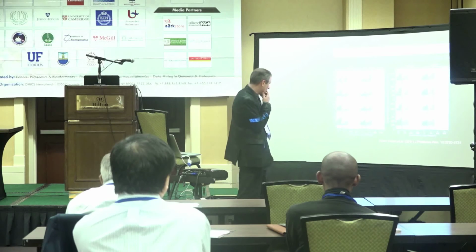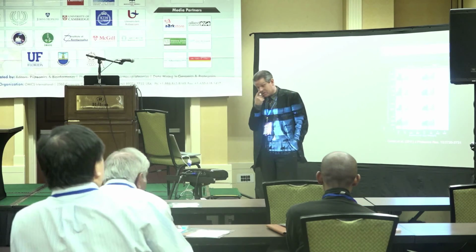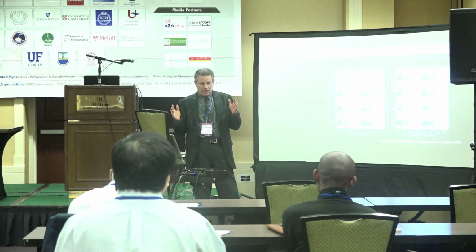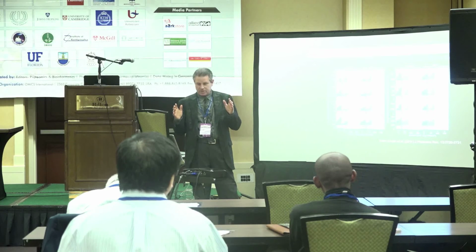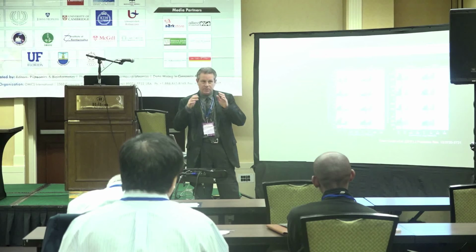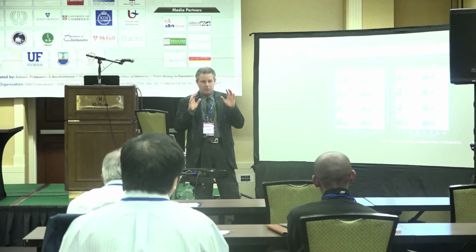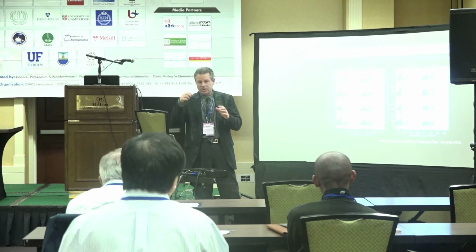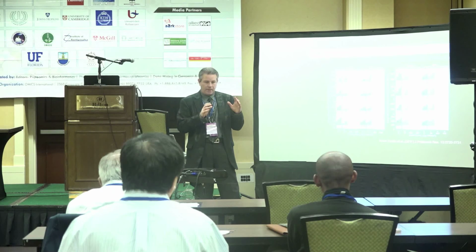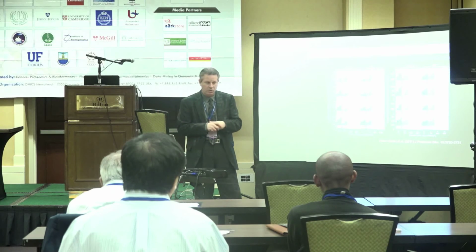Here's a study that we did with a tobacco company. I never thought I'd be working for a tobacco company, but anyways, what they wanted to do seemed reasonable to me. They had 80 rats, 10 in each group, litter matched controls. 10 females, 10 males, separate, so sex control. They were exposed to cigarette smoke in a chamber in a particulate for 5 days, 3 hours per day, and they had a low dose, a medium dose, and a higher dose equivalent to a chain smoker.